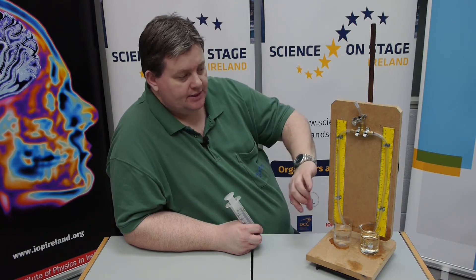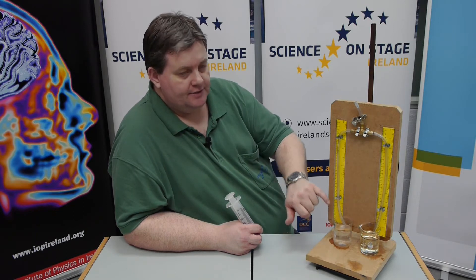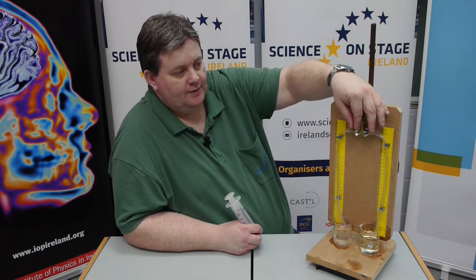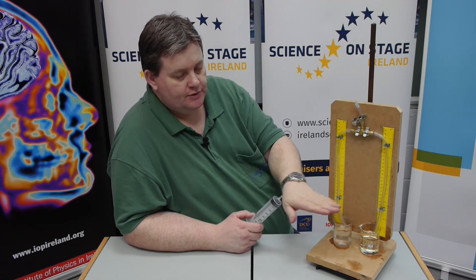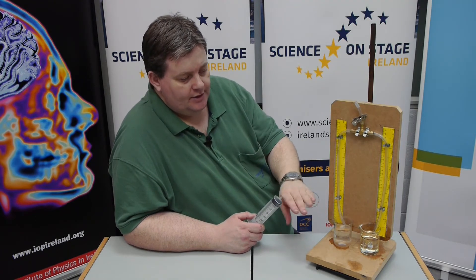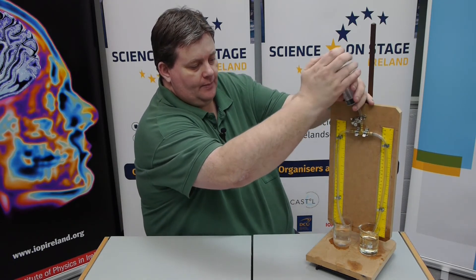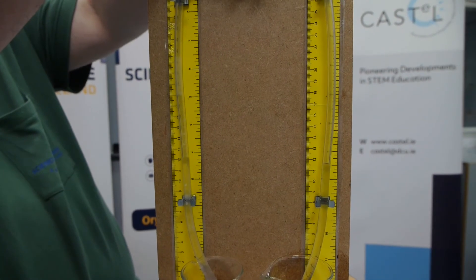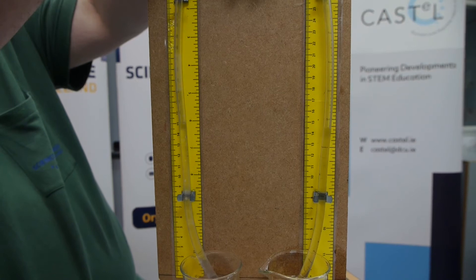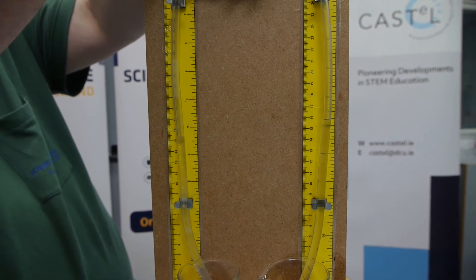Setting up the apparatus is actually quite simple. You put in both liquids and you let the system equilibrate, which means you loosen the clip at the top and you remove the syringe. You give it a moment or two to level off. Once you are happy that it has leveled off, you attach the syringe and draw both liquids up. You don't have to draw them up very far, but then you need to pinch off the tube at the top using the clip.